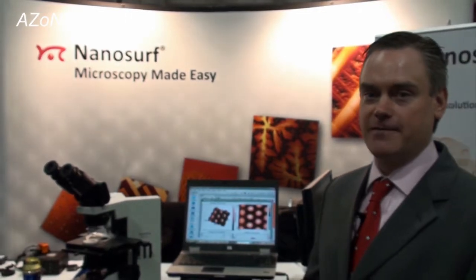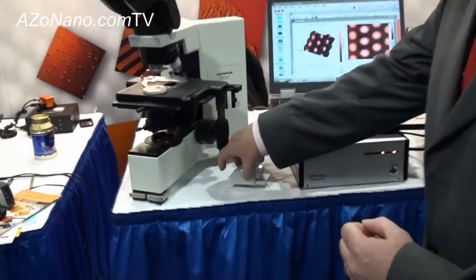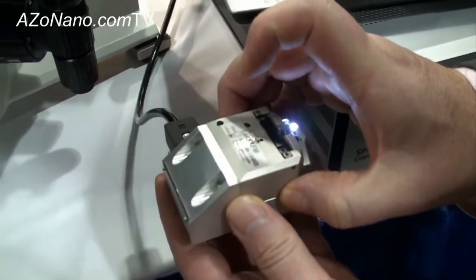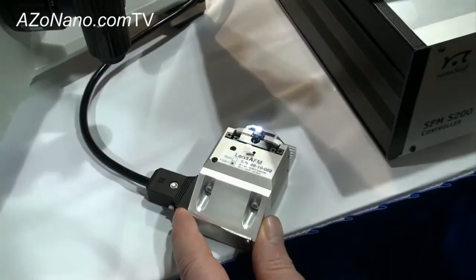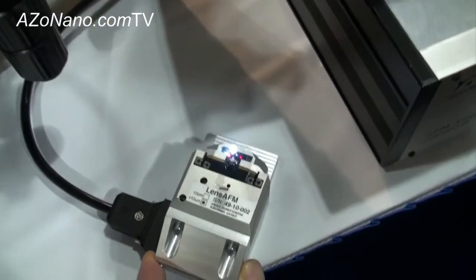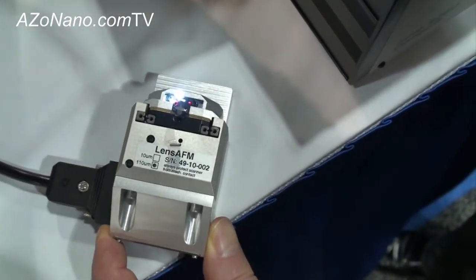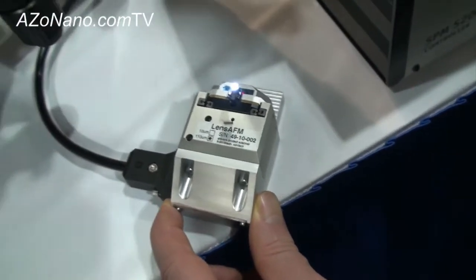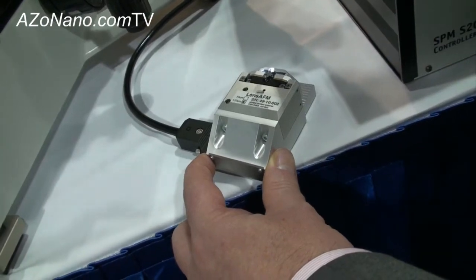The user is able to switch back and forth from AFM to the optical techniques. Today we have the system set up with a standard upright optical microscope. This is the Lens AFM head. The cantilever is mounted at the front of the scanner and, similar to other Nanosurf products, we have maintained the ease of use with the probe tip exchange — many people may know of Nanosurf's reputation for ease of use.